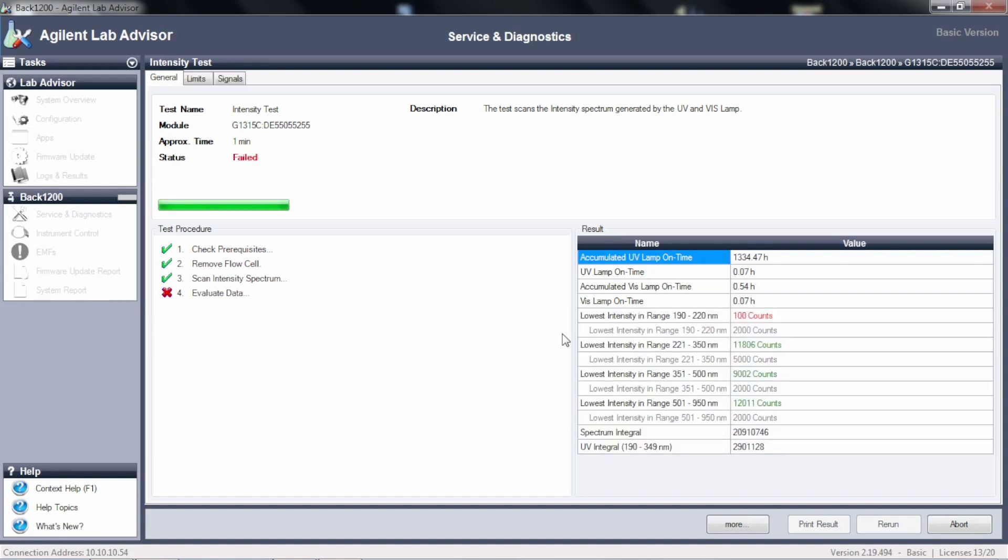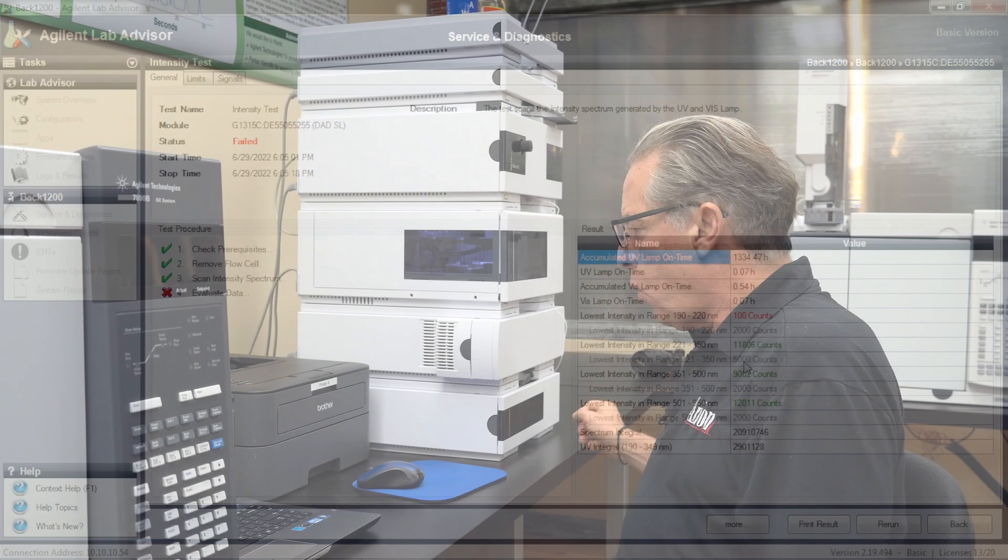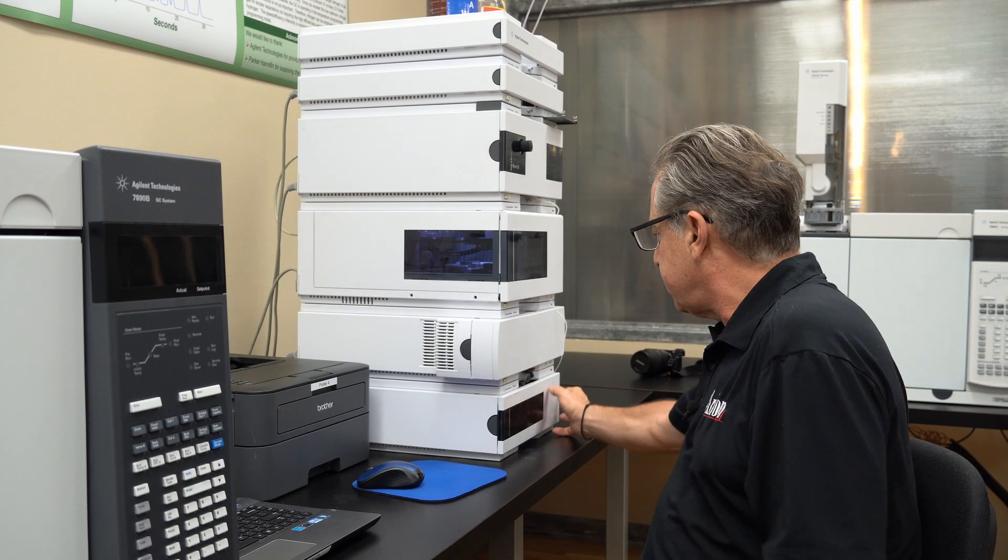And notice we failed in the low intensity, the 190 to 220. We've only gotten 100 counts. We're supposed to have at least 2000 counts. Now the regular UV, just like before, 220 to 350, that looks great, 11,000 counts, even though I'm only required to have 5,000, I've got more than enough. So now we're going to rerun the test.